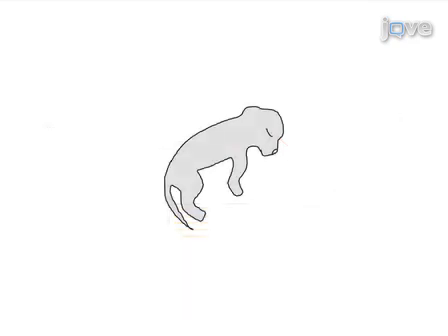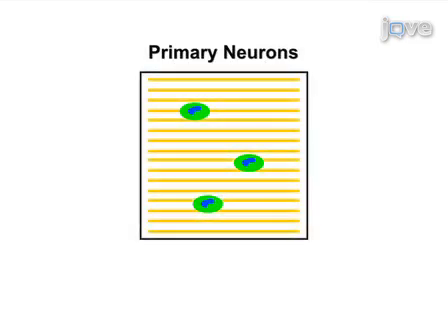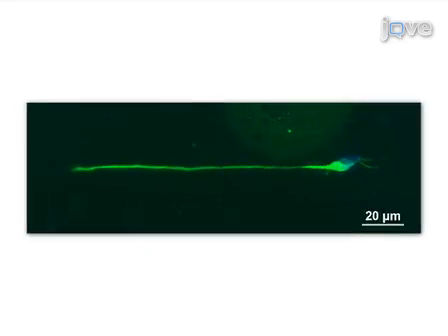Primary neurons are then obtained from embryonic day 15 rats and cultured on the electrospun fiber scaffolds. The neurons are allowed to adhere and grow. Then, they are fixed and stained using immunocytochemical techniques. Imaging results reveal changes in the morphology of neurons cultured on electrospun fibers, indicating that the nanotopography of the electrospun fibers can direct neurite outgrowth.